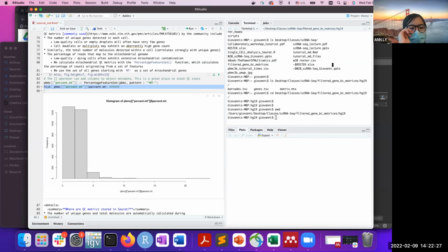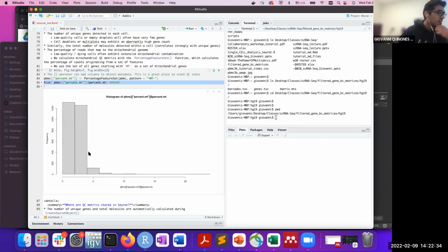No. Okay, right, so you don't have this last line of code. We're going to plot the values later anyway, but if you wish, you can add this line afterwards. I'm going to paste it in the chat. Where is the chat?